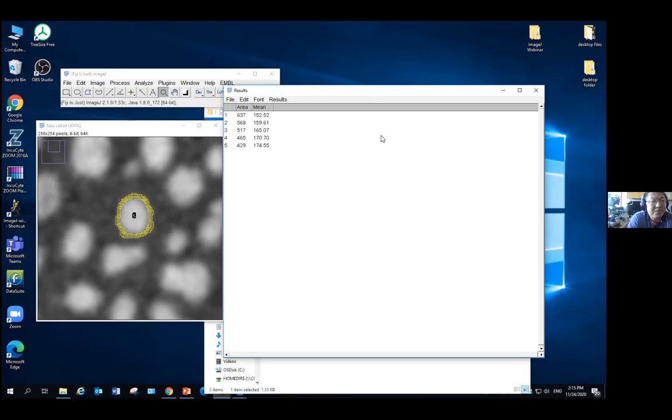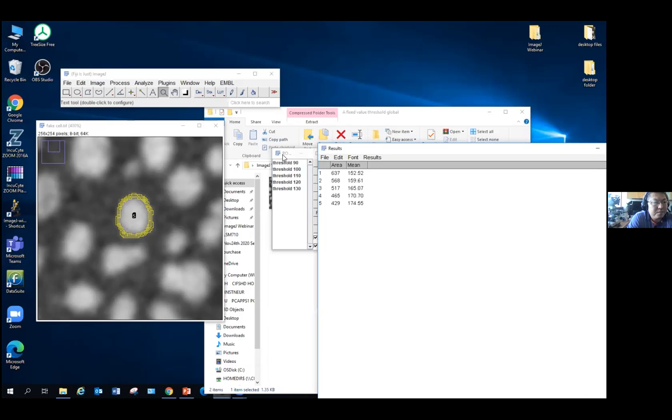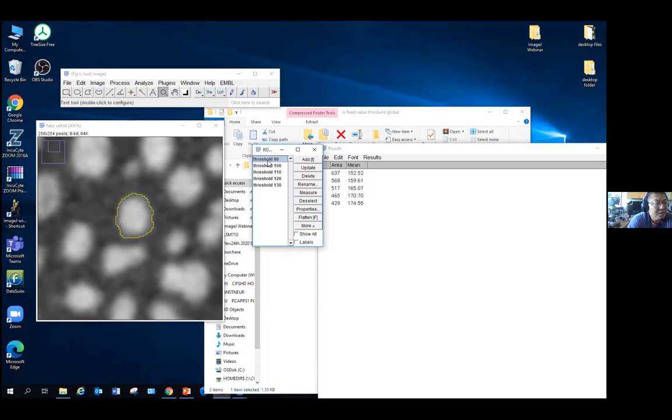So I may just feel that when I choose this thresholding here, this one will be a better representation than this one. Not exactly what I really feel. It's just maybe in my mind, I know this one will give me the result which I want, which I believe is true. Really? And it looks reasonable. I can totally defend it.